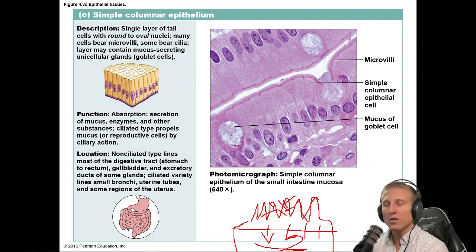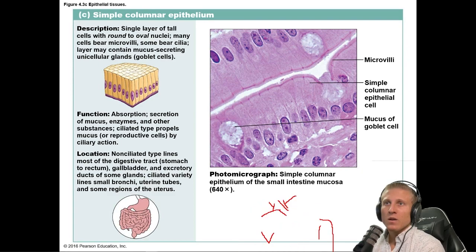Make sense? I know my illustrations are amazing. Alrighty. Anything else we need to note here?